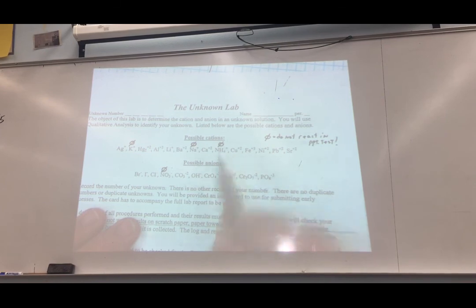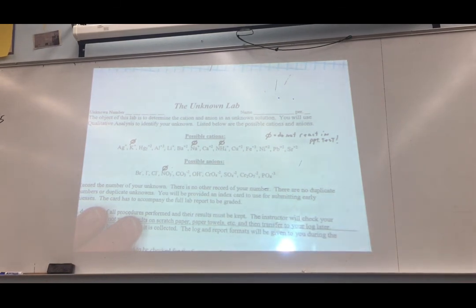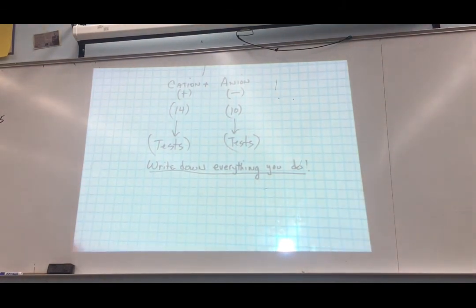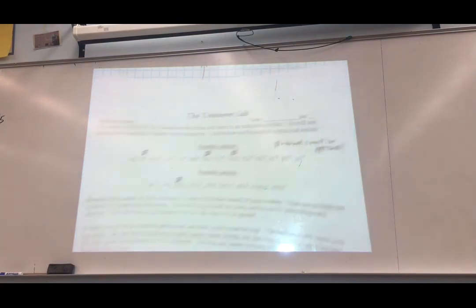You get no flame, now what do you have? 2 choices. Okay, you see what I'm doing with this? This is the way you go about it. You have to go about it very systematically. That's why it's very important that you write down everything you do on your daily log. Okay?